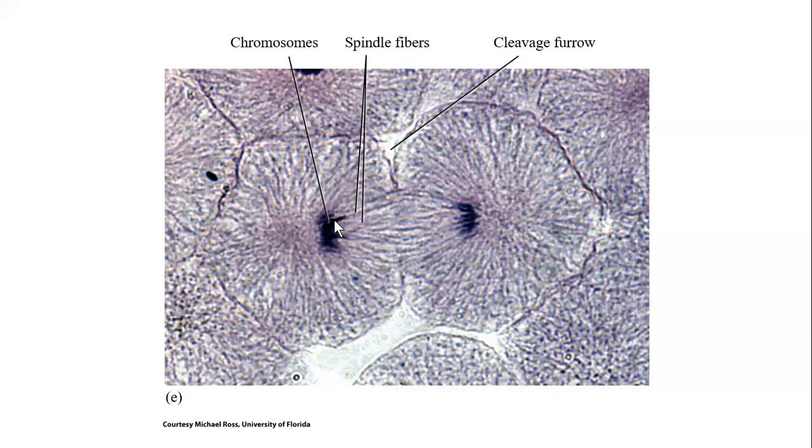In telophase, not only have the groups of chromosomes for each cell separated, but the daughter cells are now forming new cell membrane to eventually totally separate from each other. The separation has not occurred, but it's very close. This is telophase. This big gap, indentation, where the two cells are preparing to separate, is called a cleavage furrow. This is a typical structure to recognize telophase by.